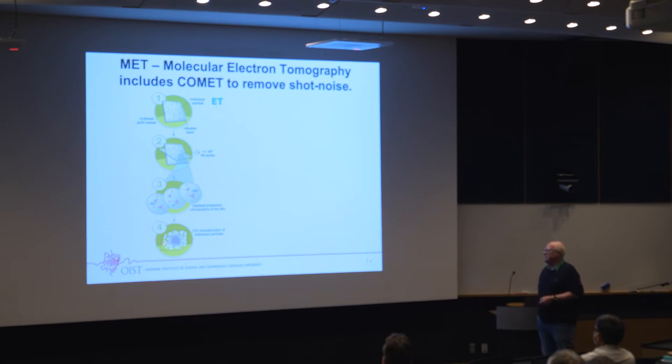And then this is where your headache starts, because when you look at this one, if you still have a specimen to look at, it means you haven't irradiated much, because it's sensitive to electron dose. So what you have down here is a molecule which is reasonably well to look at if you choose a low resolution, like 5 nanometer or worse, normally. You can, in some cases, go to higher, but you get a lot of noise in there. And that's because you use such a low radiation that you see the fluttering of your detector in terms of intensity.